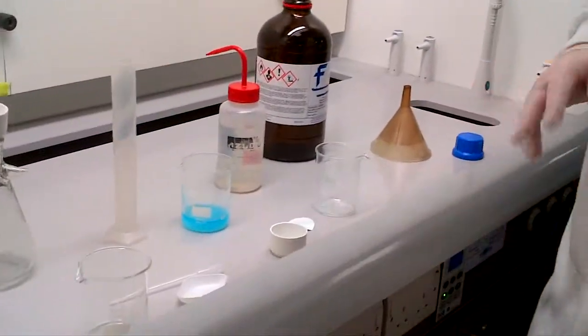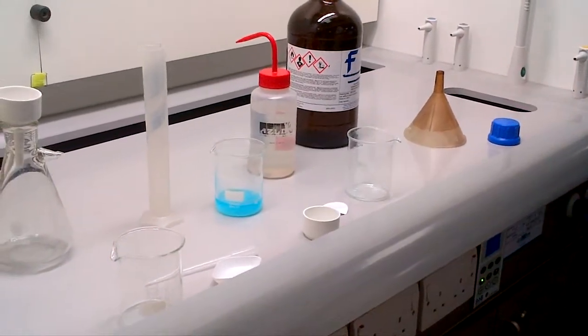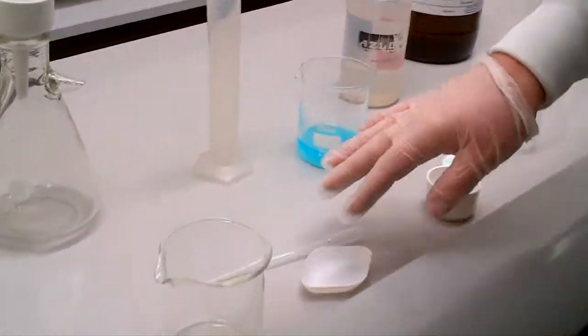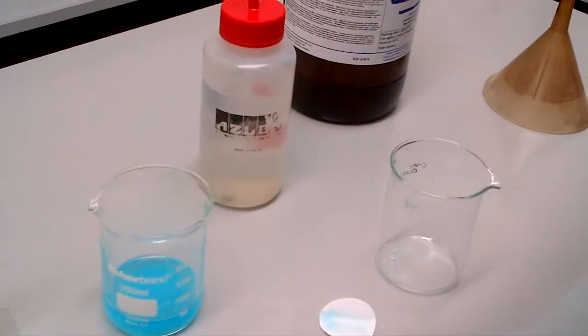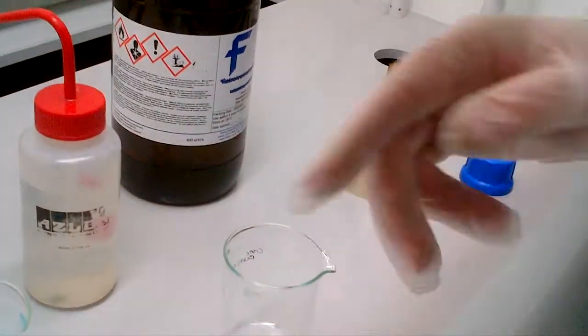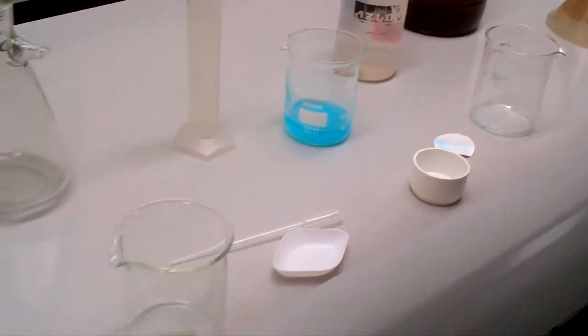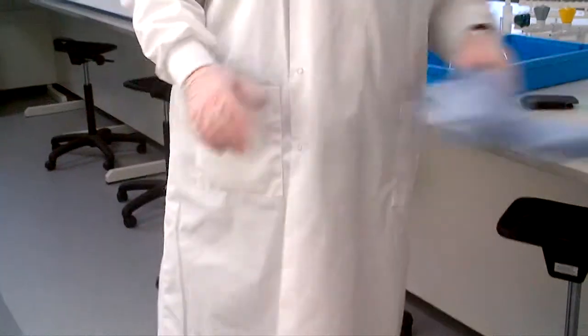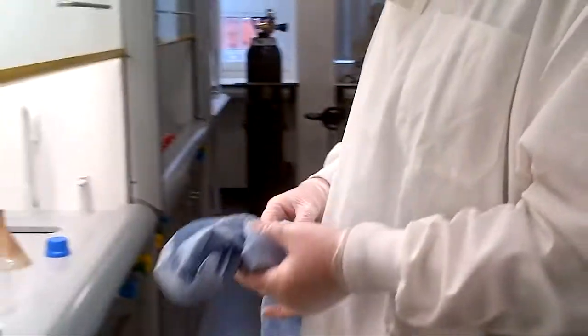If we're doing an organic practical, you will be asked to work in a fume cupboard bay. What we don't want to see at the end of the practical is your bay being polluted with glassware and bits of non-glassware waste that we're expected to deal with. We want you to clean up. This video tells about how to go along in the lab with GLP, with spillages and cleaning up.